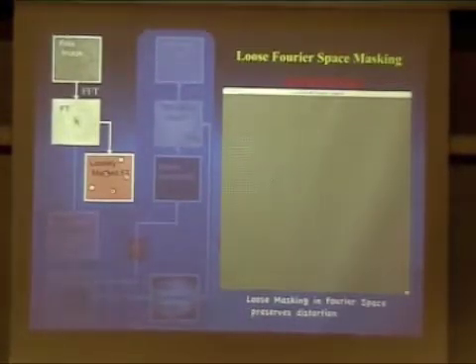You can see how it started to distort around the different areas. One thing I should mention is that these are two processes. I think this is a remarkable picture, and what is amazing to me, just staring at it, is that it looks really nice in terms of symmetry. You have in many places low contrast. Where you see very high contrast, there is something fishy.